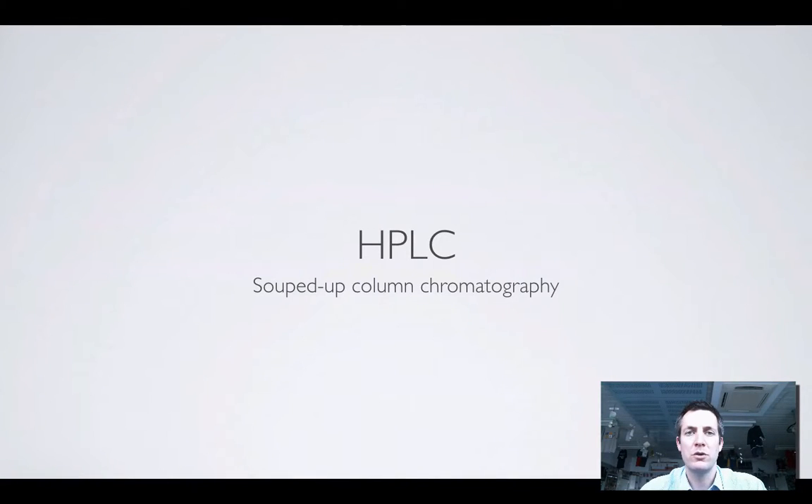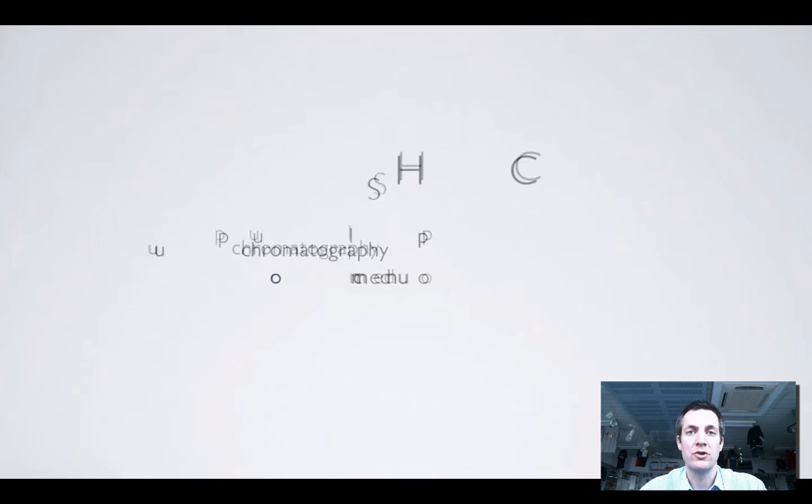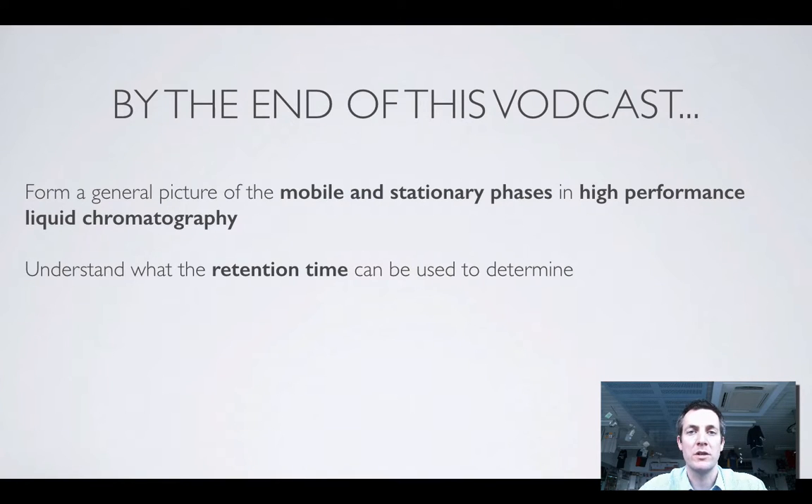Hello and welcome to this film which is all about another type of chromatography called HPLC. As I said at the start of the TLC film, hopefully by now you know in general terms how chromatography works. Really all this film is about is showing you in a small amount of detail how high performance liquid chromatography works, how we set up the physical equipment used to do this experiment, and also we'll know what retention time is.